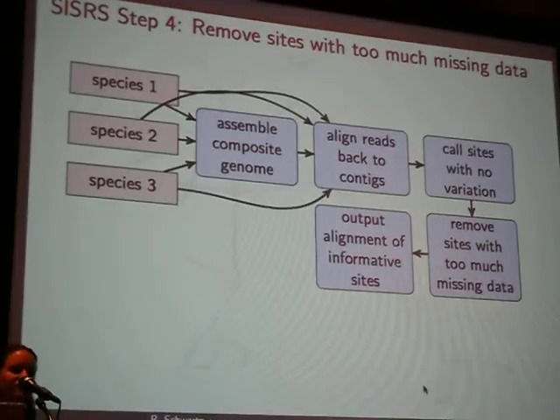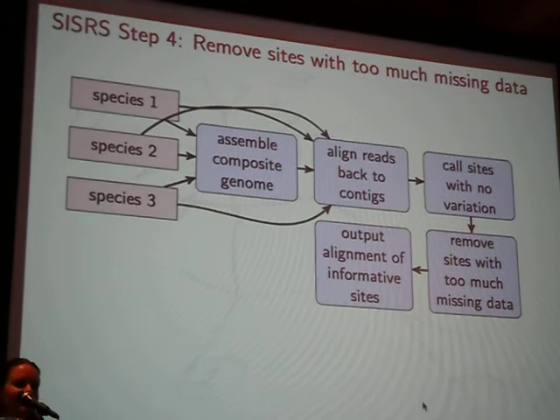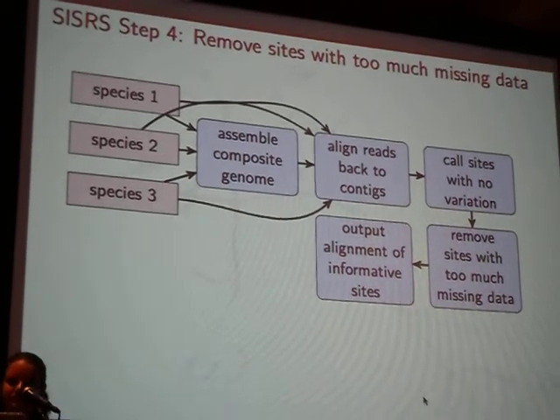We're going to remove sites with too much missing data. This is up to the end user, how much missing data you're willing to deal with. And you end up with an alignment of what should be mostly informative sites.